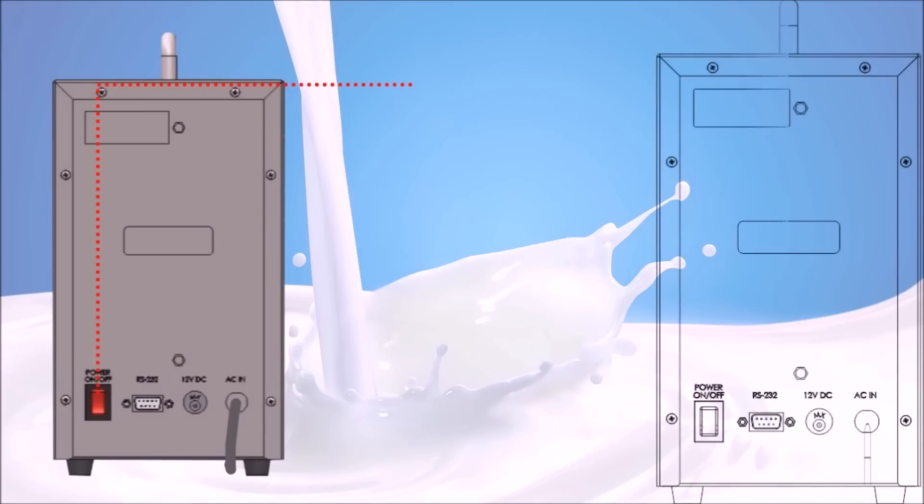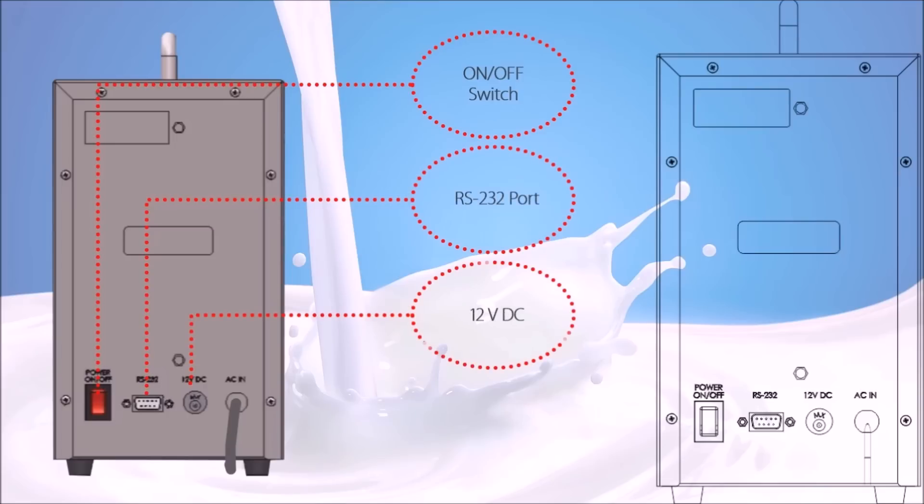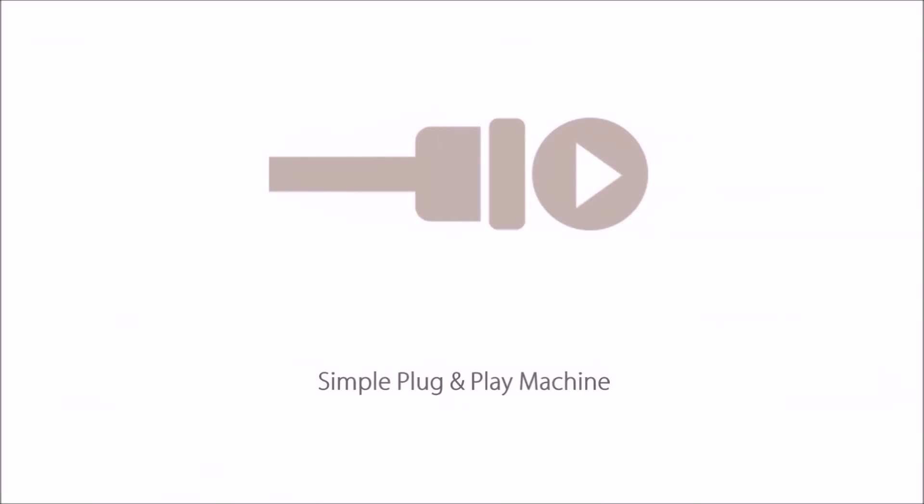The rear side consists of power switch, RS232 communication port for data transfer, 12V DC power socket and 230V AC power cord to ensure functioning both with AC and DC power supply. It is a simple plug and play machine.